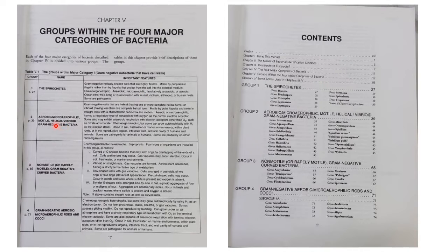Then next is aerobic, microaerophilic, motile, helical, vibrioid, gram negative bacteria. This is the second group. Even the important features of this particular group are given. Not just this, the important features of all 35 groups are mentioned here in short. So if you have confusion about deciding which particular group my isolate belongs to, you can read this information, the important features, and then you can decide.